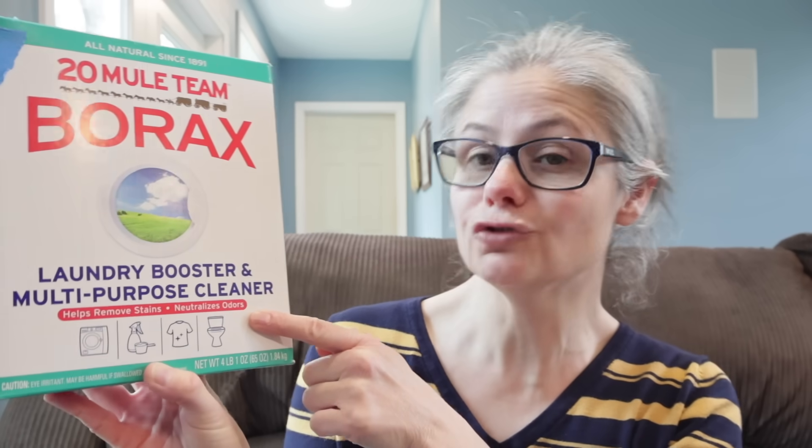Personally, I would not use borax as my go-to to remove bacteria. However, it did do a good job at decreasing the bacterial load on the cloths so that it could be almost completely eliminated in the dryer. Importantly, nowhere on this box does it claim to remove bacteria — it claims to help remove stains and neutralize odors. When you're neutralizing odors it's probably because you're decreasing bacteria, which it can do, but it doesn't actually say it removes bacteria. I will add borax to my next t-shirt staining test — this will be the fourth one — to test its ability to remove stains, which is what it actually claims to do.